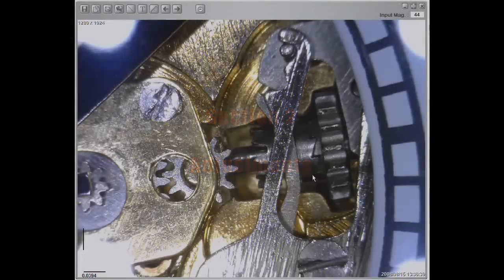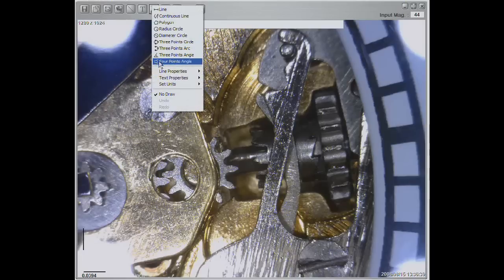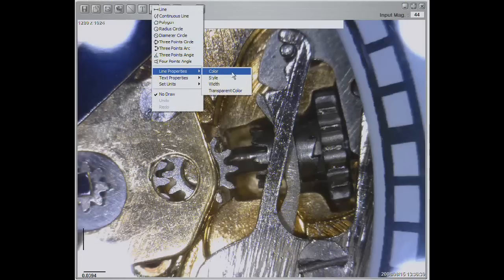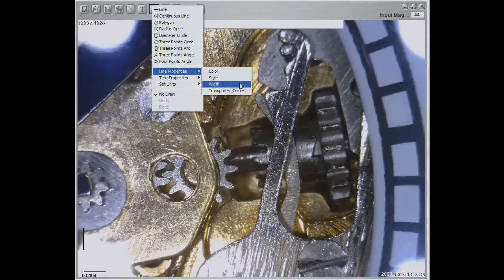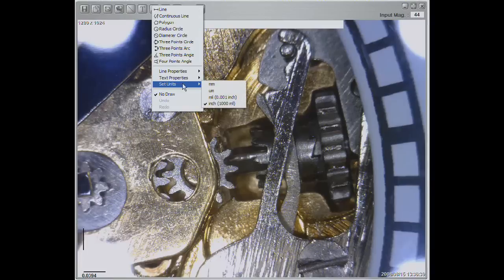Press the measure button to find customization options. You can adjust line properties such as color, style, width, and transparent color. You can also adjust text properties such as color and font. You may also set the units to millimeter, microns, mils, and inches.